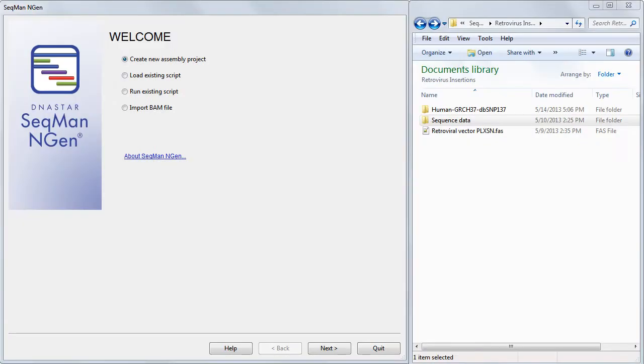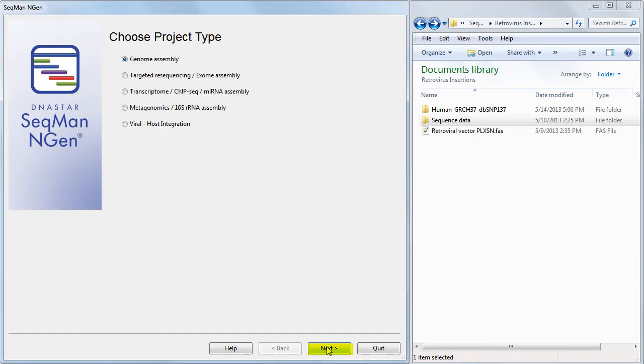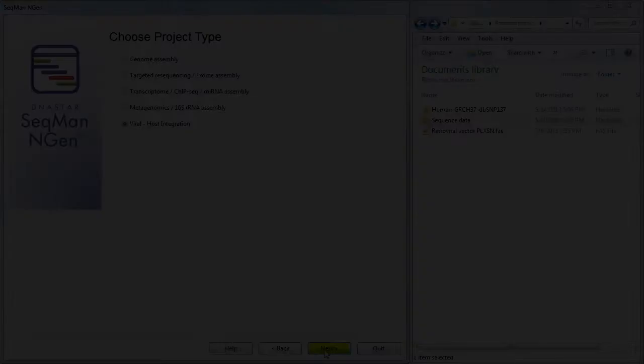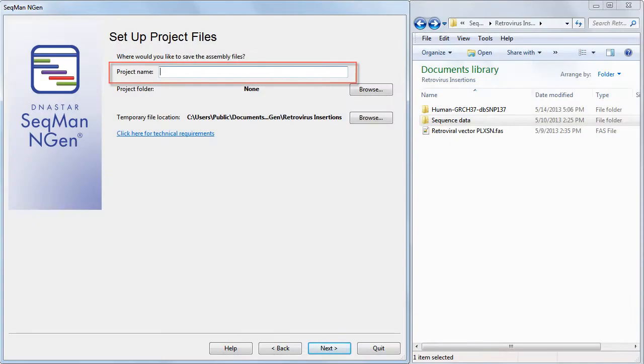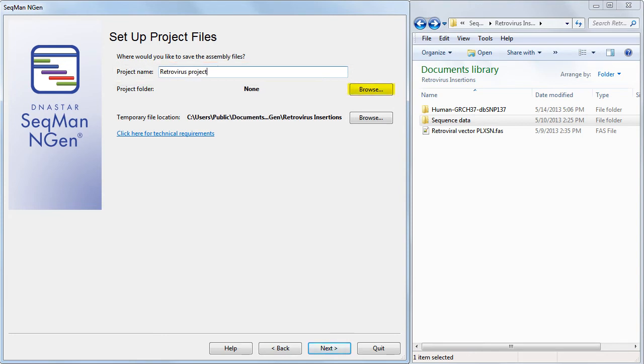In SeqMan NGen, we'll start by specifying that we want to create a new assembly project of the viral host integration type. In the Setup Project File screen, we need to type in a name for the project and specify a project folder.